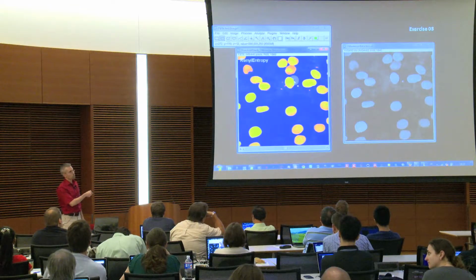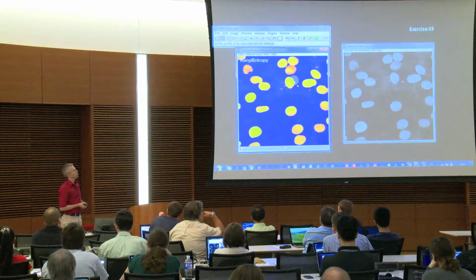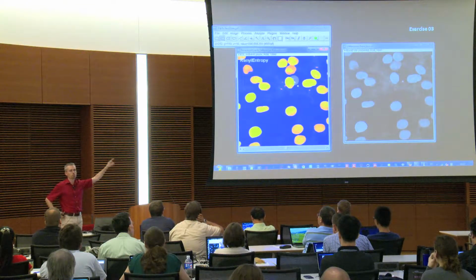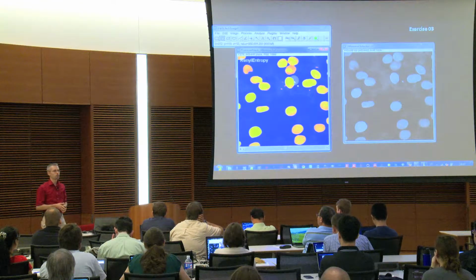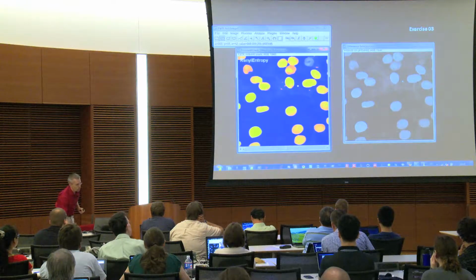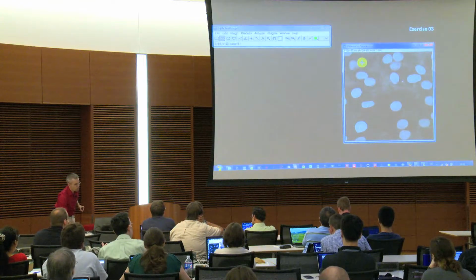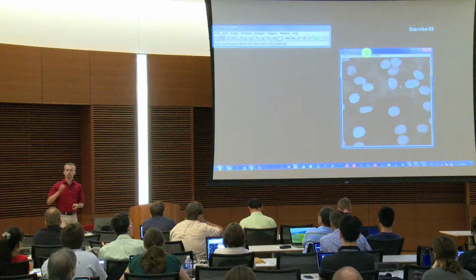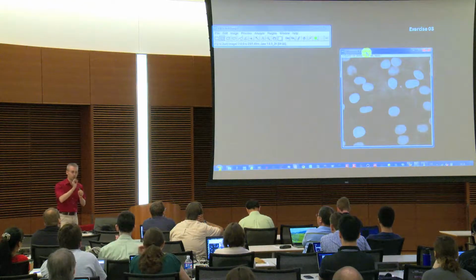You see the connections. We need to deal with that because we want to have our particles individually. So how can we do that? We can directly test it with the threshold check. If we use a specific threshold, can I then still separate my particles afterwards using the normal watershed function? So this means I run this again, so I close that. And then it is important, otherwise some of you might get artifacts, that we define that we use a black background in the binary image and white particles.